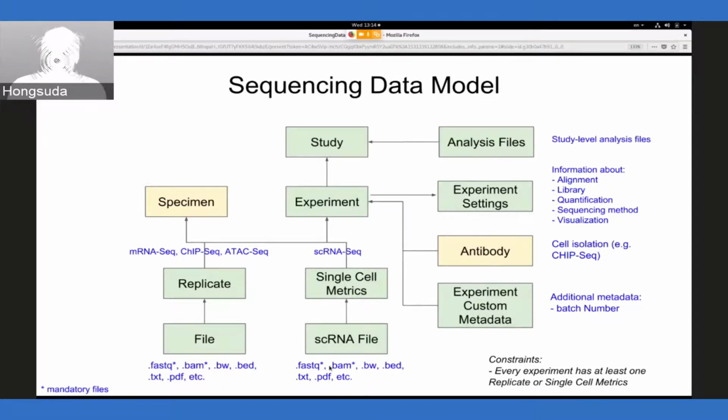Okay. Right. So then these are raw analysis files relevant to a specific sample, or a specific replicate. Some questions came up that if you aggregate across all these different replicates or experiments, where do I put those data analysis files? So this is actually the place where they will be putting up those files at that level. Okay. All right. Thank you.